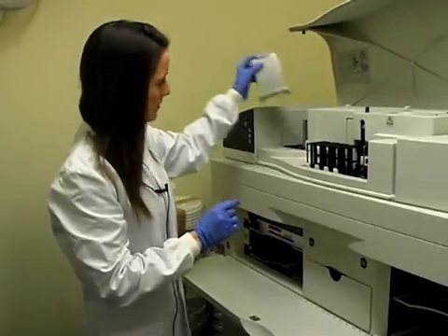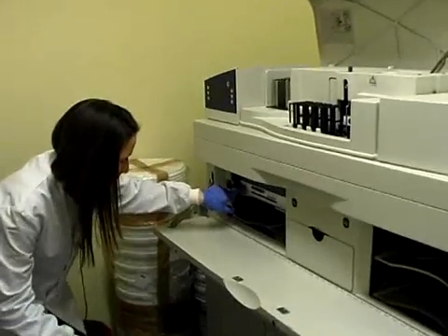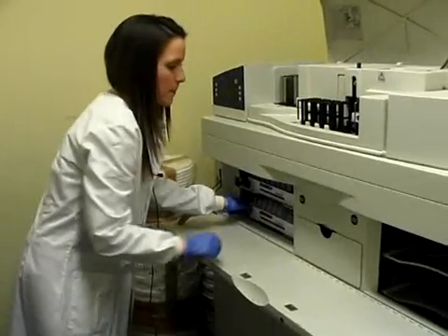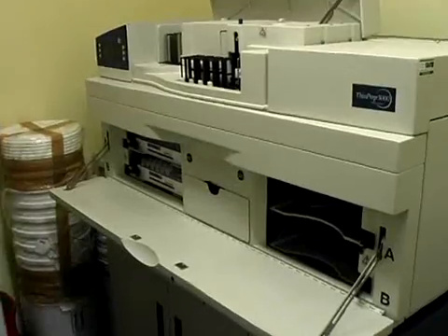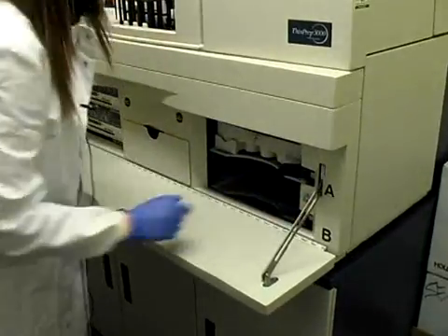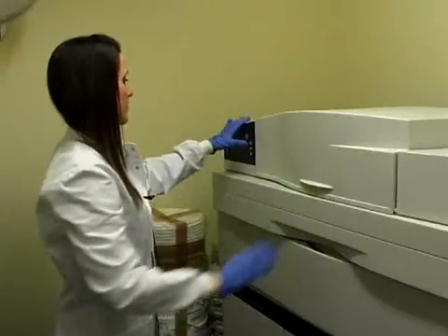We make sure the slide holders are both full up. We then have to make sure there are filters in place, and then we slide the new rack in. We unlock where the vial racks go, put them in, and lock it all into place.